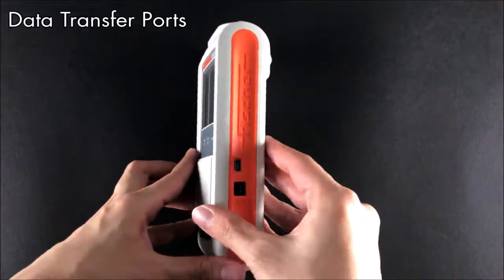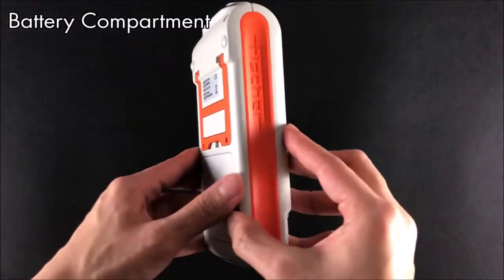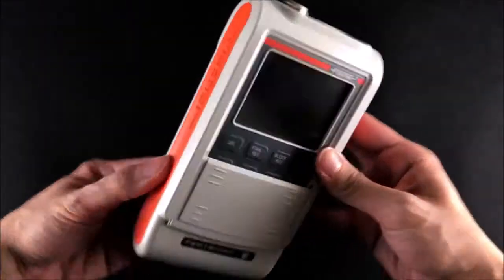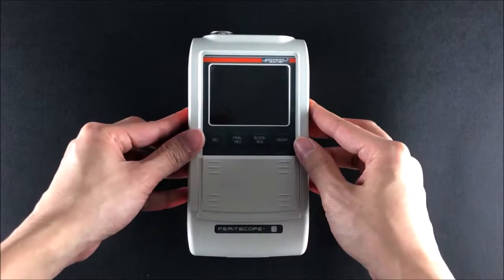The ferrite scope is a portable instrument with a range of probes to reliably determine ferrite content on site, even in hard-to-reach areas. It also has data transfer abilities where measurement data can be transferred to the PC and evaluated.